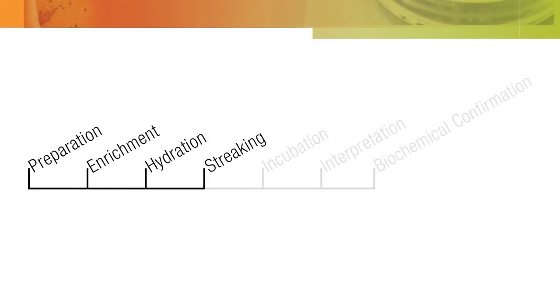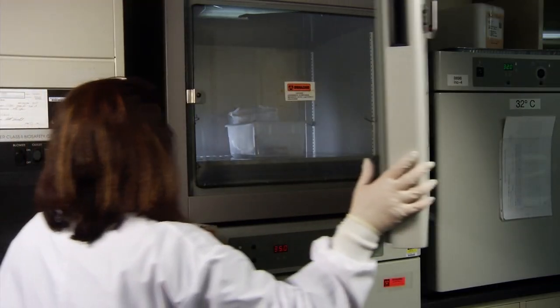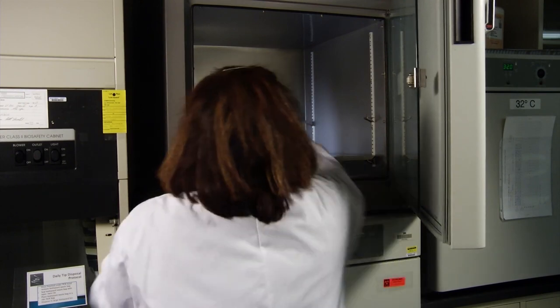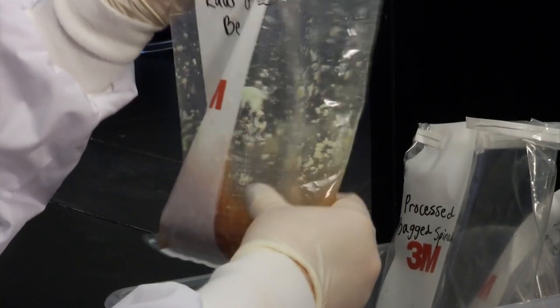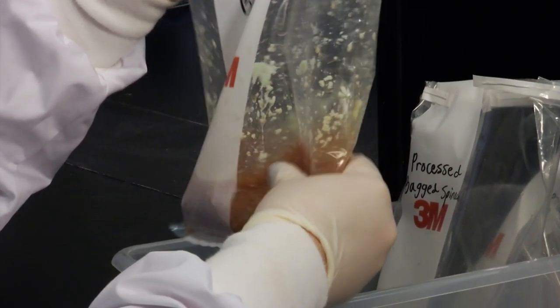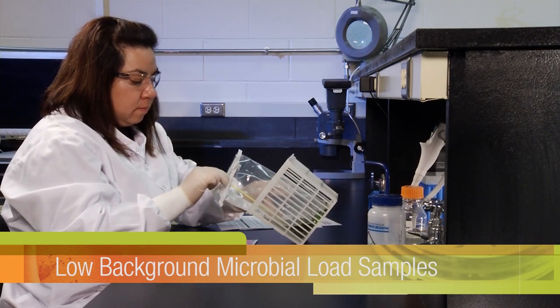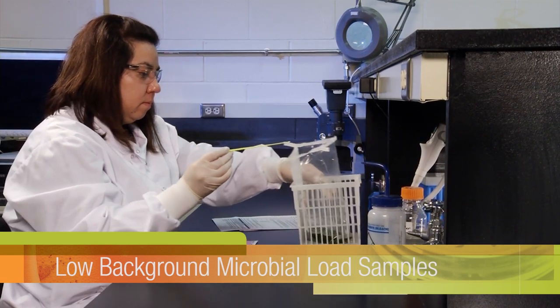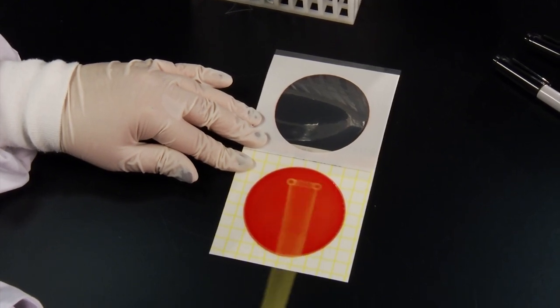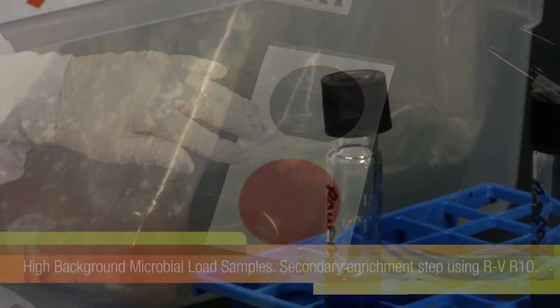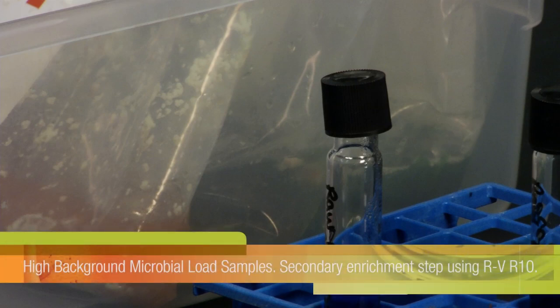The next step is streaking your enriched product samples onto the pre-hydrated 3M PetriFilm Salmonella Express Plate. Remove the enrichment medium from the incubator after the required incubation period and agitate its contents by hand. For low background microbial load samples, proceed directly with streaking the enriched sample onto a hydrated plate. For high background microbial load samples, perform a secondary enrichment step by performing the following.